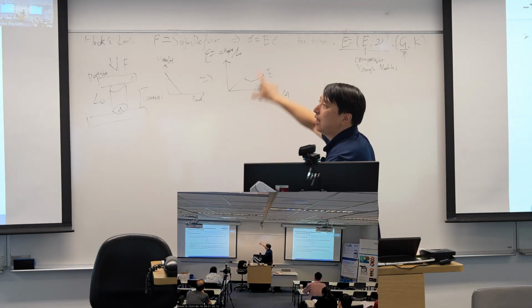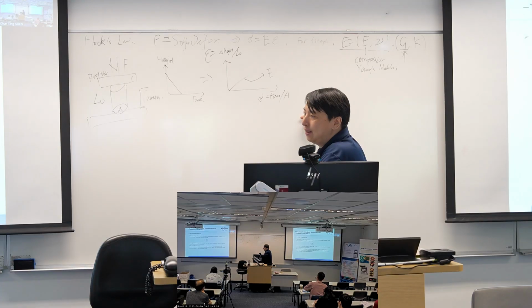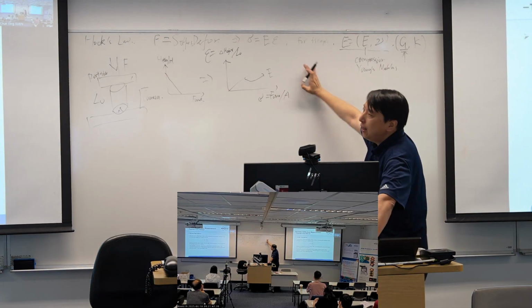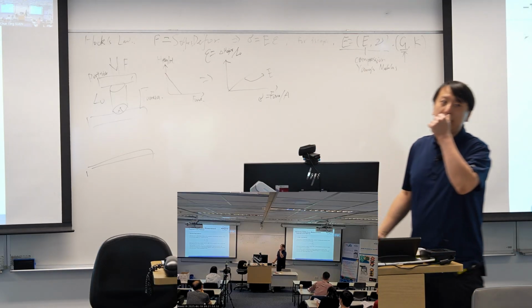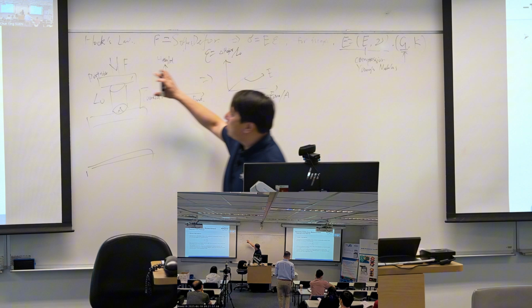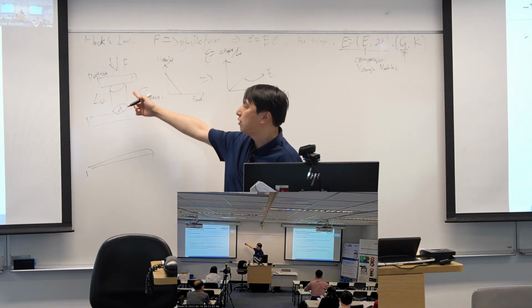That's how we measure it for macro-scale material using a macroscopic instrument. And for our AFM, the story is different, because we use AFM to measure the property at the nanometer scale. So we cannot define our samples in such a shape.